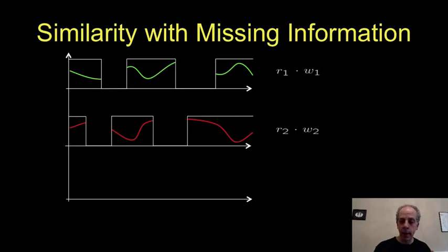Very important, we basically don't have the missing wedge in the same place. Remember, these particles were rotated. So the missing wedge is fixed for a particular acquisition, but the particles are all rotated. So with respect to them, the missing wedge is all the time in a different position.